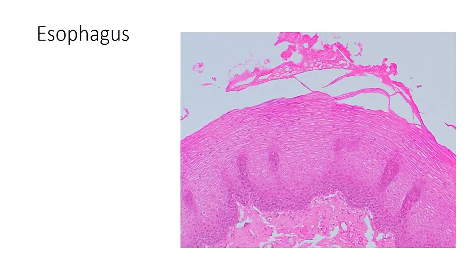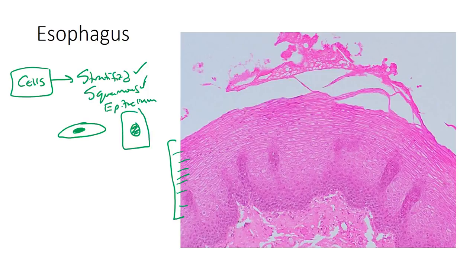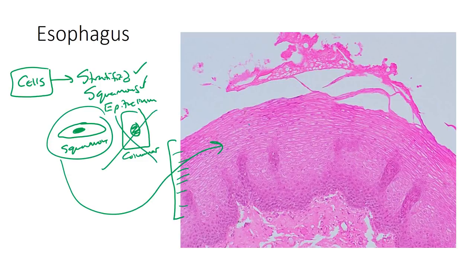We said the organ, the stain, the magnification — and now the type of cells. You can probably see more cell detail in a higher magnification of the same tissue, which is why they give you multiple slides. The cells present here are going to be stratified squamous epithelium. Why stratified? Because there's a bunch of layers. Why squamous? Because the cells look flattened, rather than columnar — which would be columnar cells. In this case it's not columnar, it's squamous — that's what you see here.